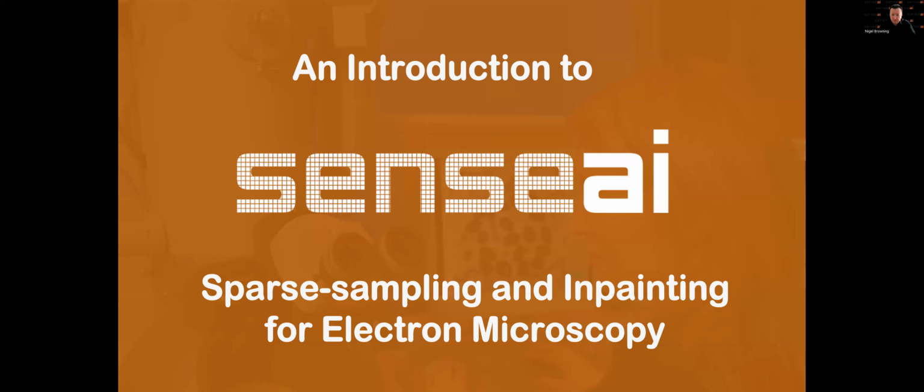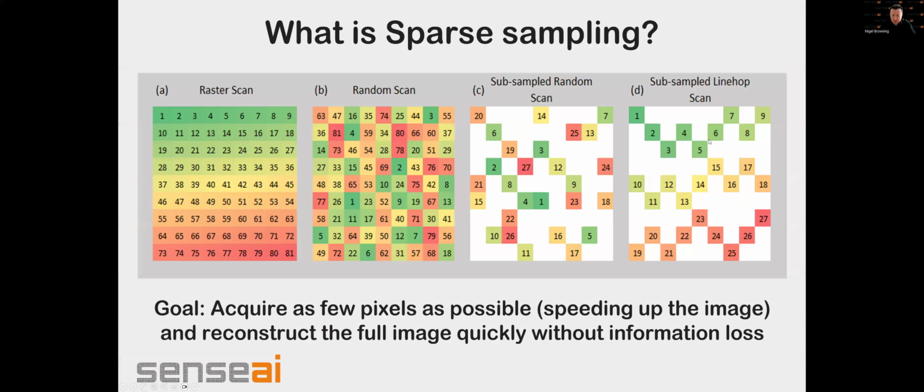So just to give an example of how the approach works, let's start off by talking about sparse sampling. Sparse sampling is pretty much the way that it sounds. Typically, when we're doing a scanned image, we do a raster scan, which is much like a word processor works. We type all the way across to the right-hand side, and then we flip back to the beginning, one line below. Now, if we want to randomize this scan, we can do what we've got in the middle, and so we can have a random scan instead of a raster scan.